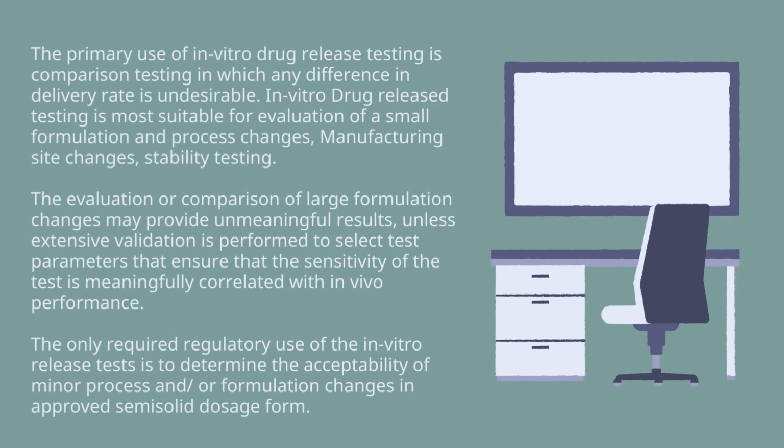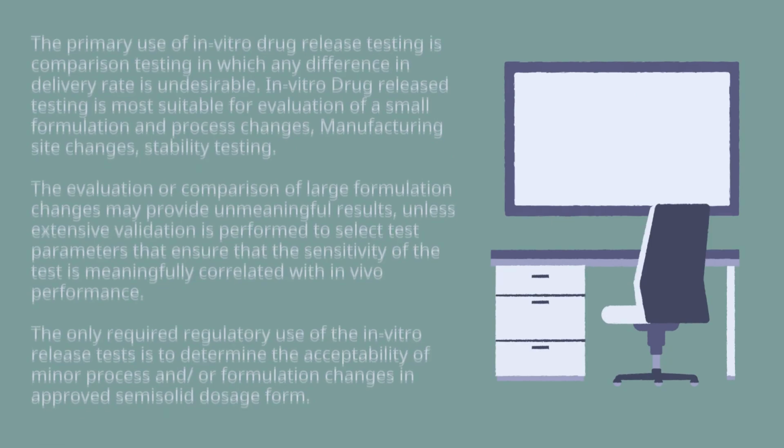The evaluation or comparison of large formulation changes may provide meaningless results, unless extensive validation is performed to select test parameters that ensure that the sensitivity of the test is meaningfully correlated with in vivo performance. The only required regulatory use of the in vitro release test is to determine the acceptability of minor process and/or formulation changes in approved semi-solid dosage forms.